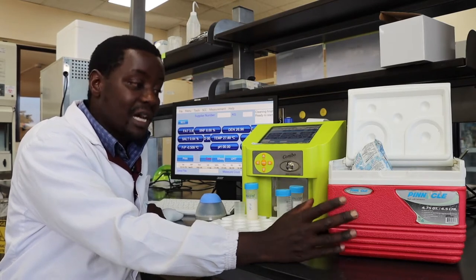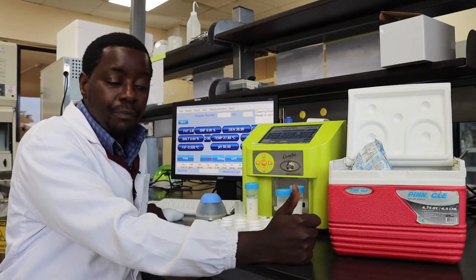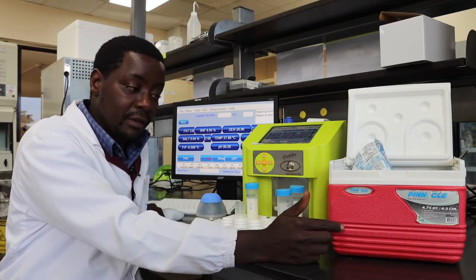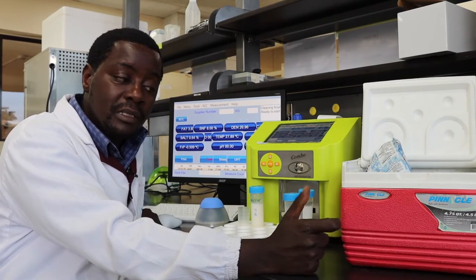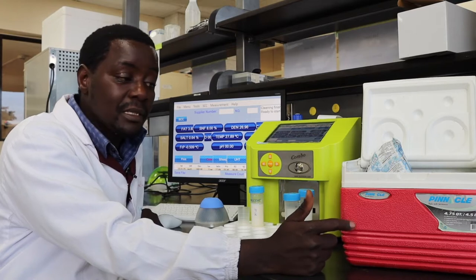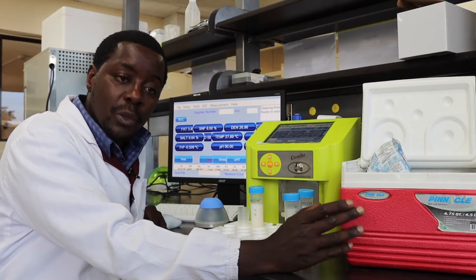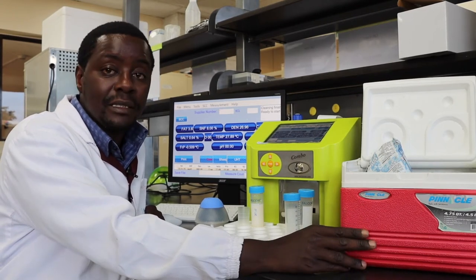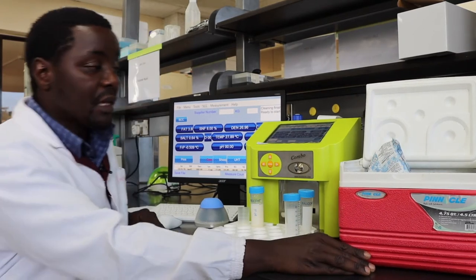If you don't have that kind of system, there are other alternative ways to preserve your sample pending analysis. The major concern in preserving the sample is to make sure it maintains its chemical integrity. To do this, we use chemical means — there are commercially available tablets known as bronopol tablets, which are added into the milk samples. There are still other alternative methods for chemical preservation of milk, but that's not within the scope of this tutorial.